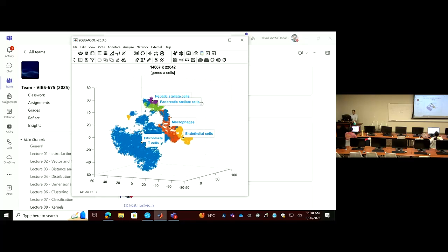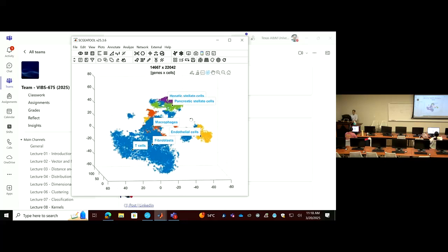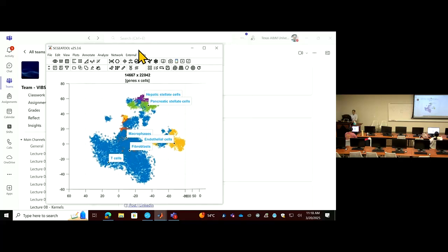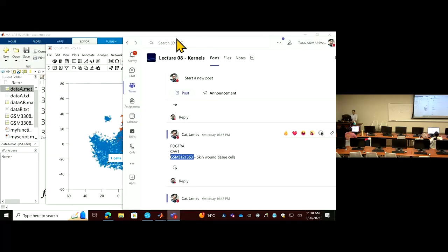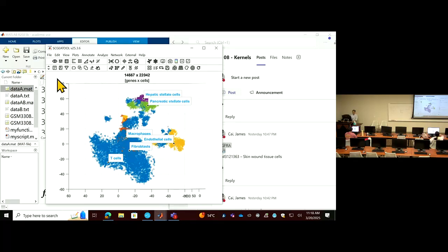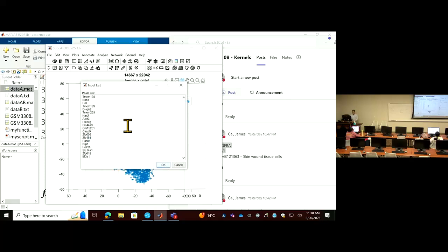We are going to look at two genes' expression. These two genes are this ligand receptor pair. So you can copy these two gene names, and then from here we can select genes, the first button here, and then you just paste these two gene names in there.